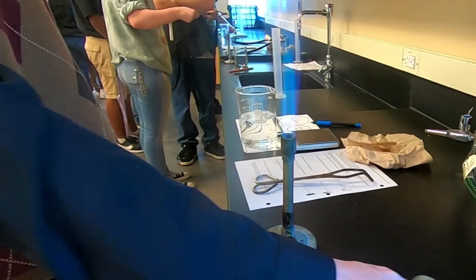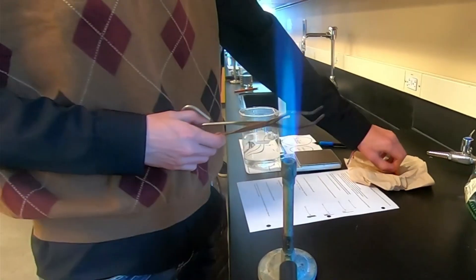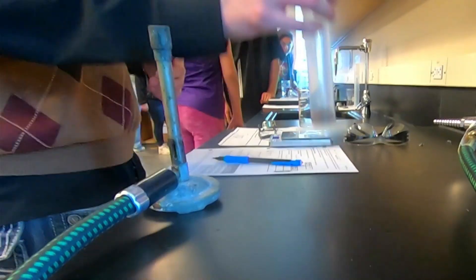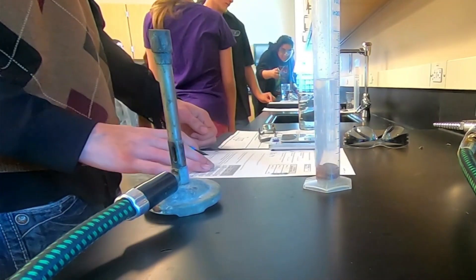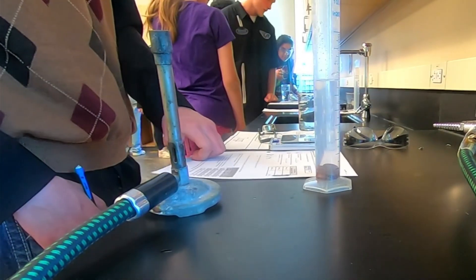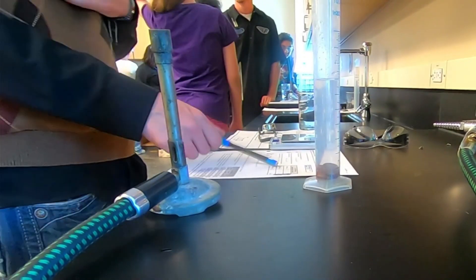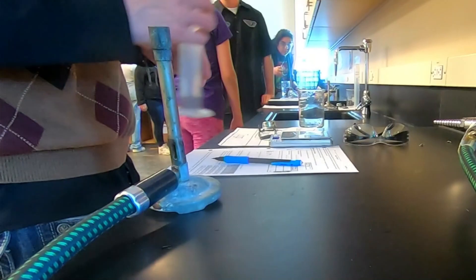Then we took our initial volume. You can see the student is taking the initial and final volume of the pennies in the graduated cylinder. The initial volume we had in our graduated cylinder was 70.0 milliliters, and then our final volume was 73.2.